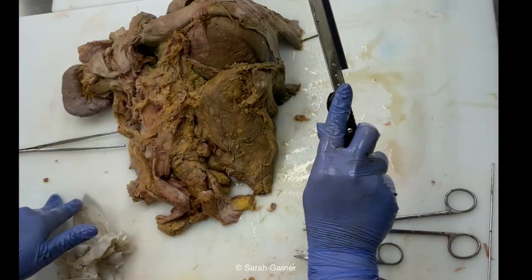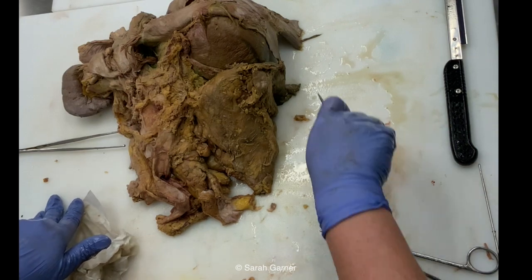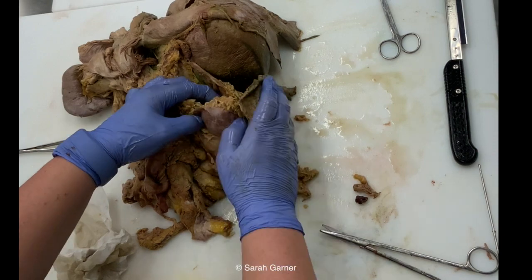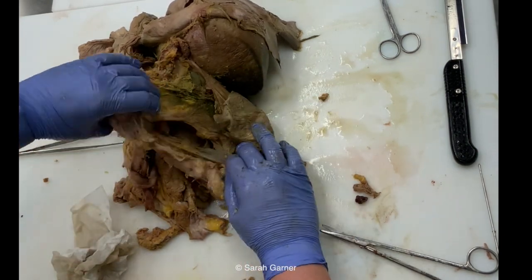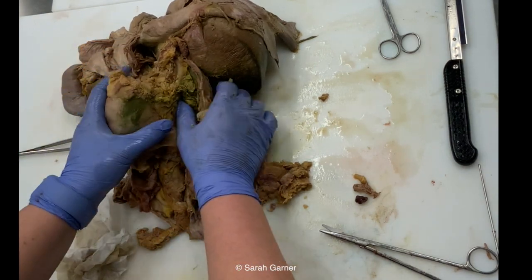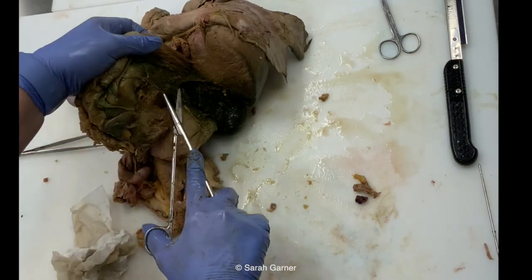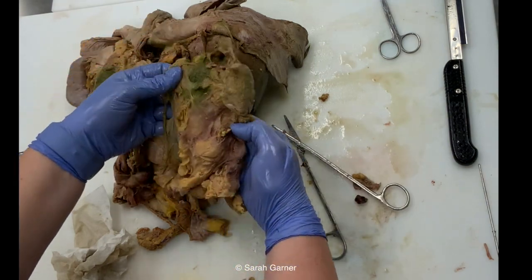Make sure you know where your blade is at all times so that you are not accidentally going to graze it. So with this, again, I told you I like to start by peeling off the fat. That's what I'm doing here. Now, if you were doing that and the adrenal was in there, yikes. So make sure if you're doing this that your adrenal is already dissected off. That's why we do that first. Okay, so this is all just fat.